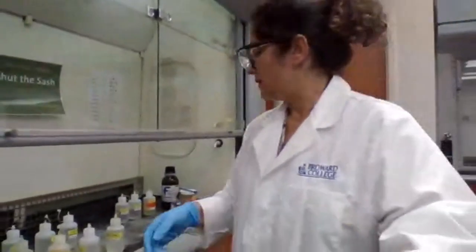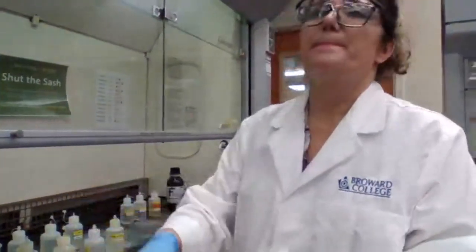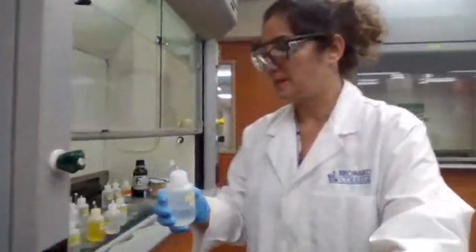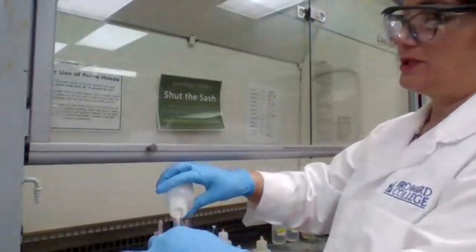I'm going to use the 15 molar ammonium hydroxide. You want to add it to make sure the solution is basic.